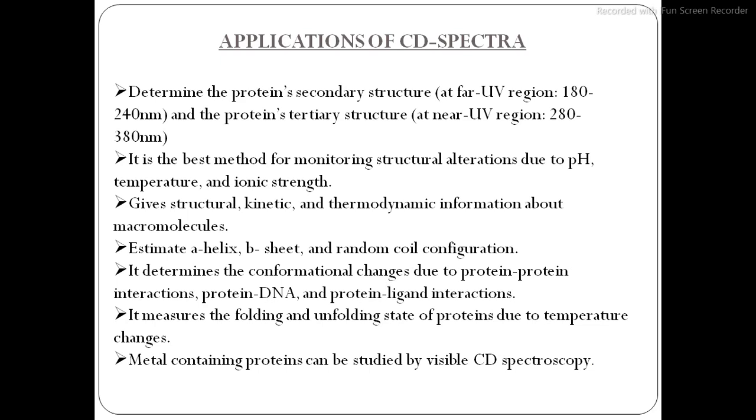It measures the folding and unfolding state of proteins due to temperature changes, and metal containing proteins can be studied by visible spectroscopy.